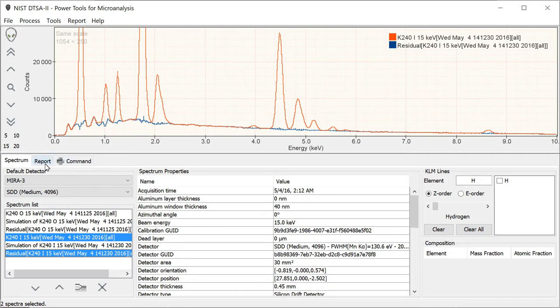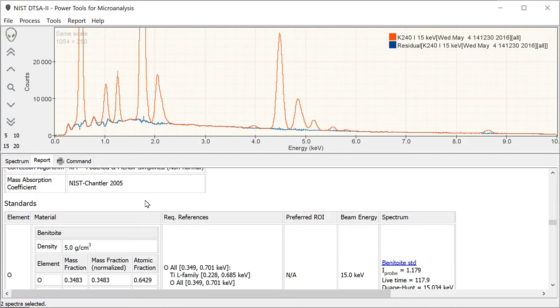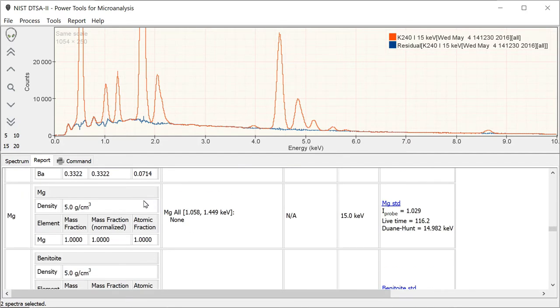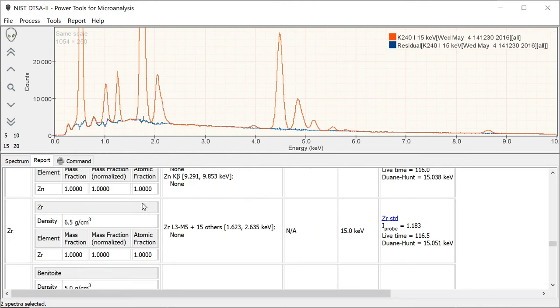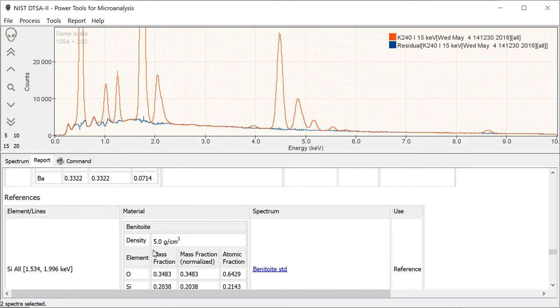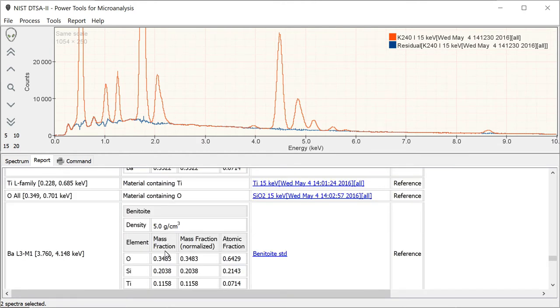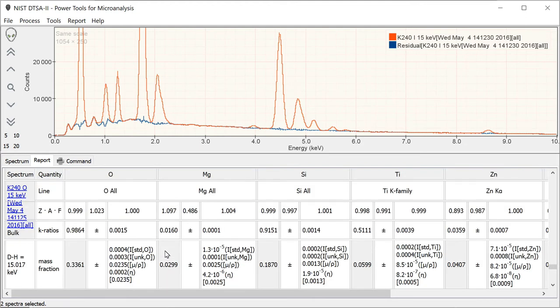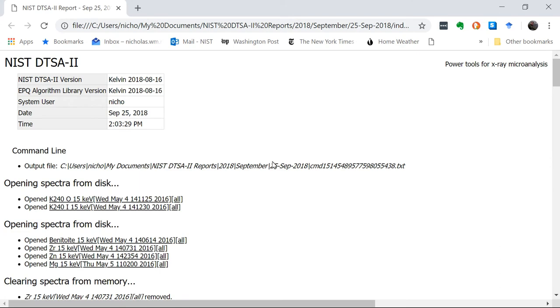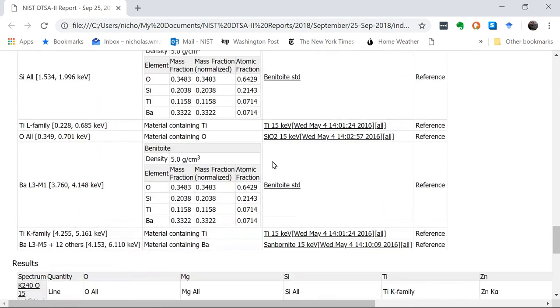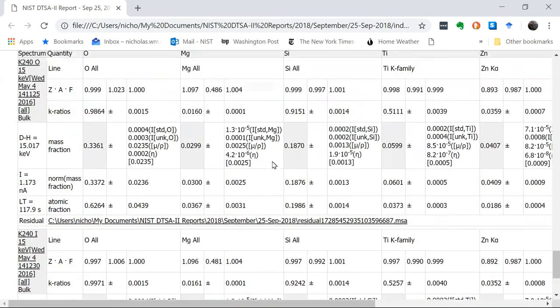Finally, go take a look at the report. We get our output, all the information about the standards that were used, the references that were used. And then this table provides us a summary of all the output results. To make it easier to look at, I'll open it in a web browser. Now we can go down to the bottom here and look at our results. Typically, these are the numbers I would copy out. In general, this shows you how you would go about quantifying a spectrum using a complex standard like the Benitoite.